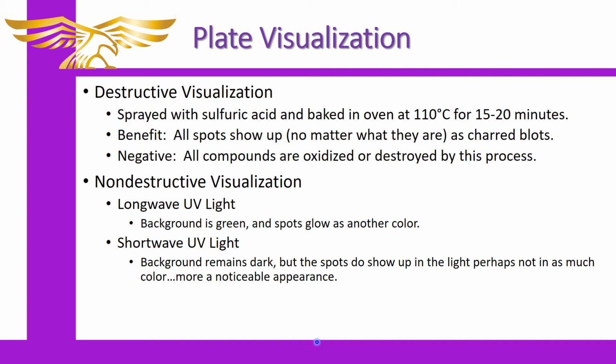There are different kinds of visualization methods. There's destructive visualization, which is called destructive because even though we can see all the spots with it that have traveled, we will oxidize and destroy all the compounds in the process. So it's destructive. We can't recover any of that material.